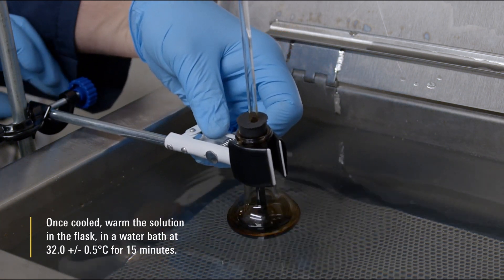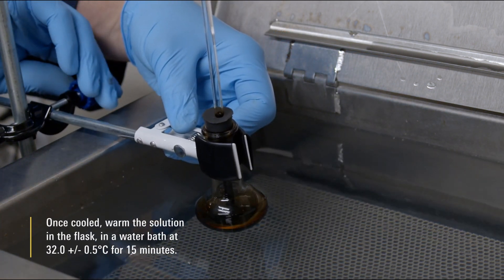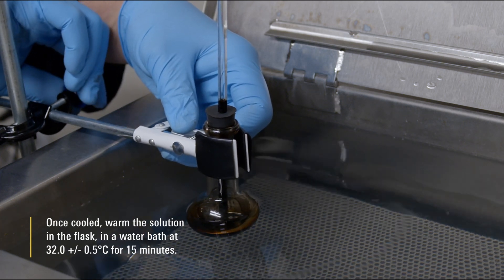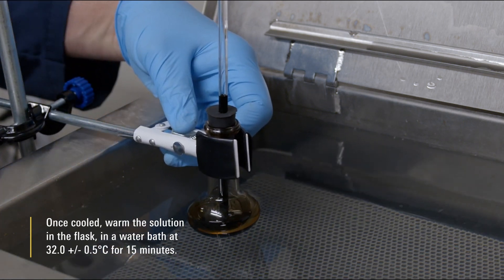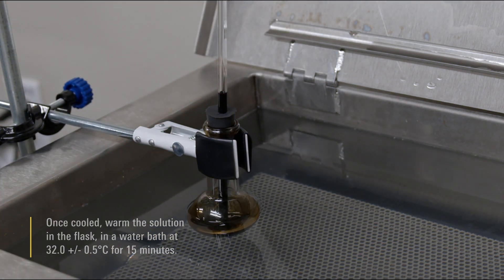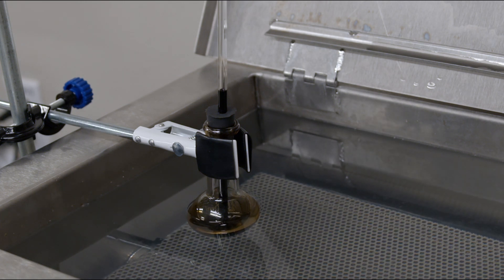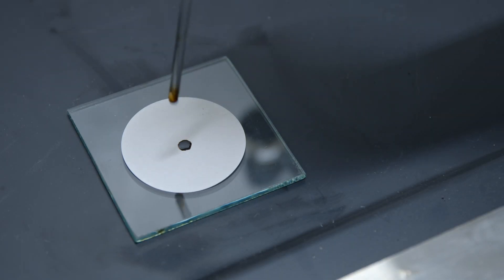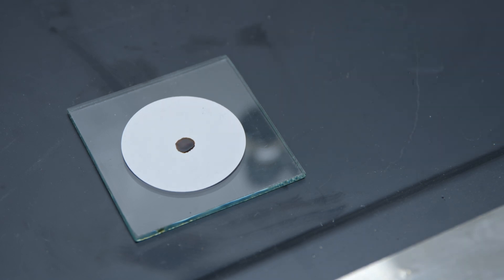Once cooled, warm the solution in the flask in a water bath at 32.0 plus or minus 0.5 degrees Celsius for 15 minutes. Stir the sample thoroughly. While the sample is warm, use a clean stirring rod to place one drop of solution on the filter paper.